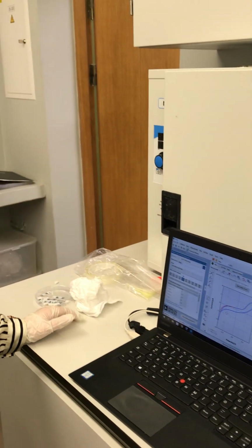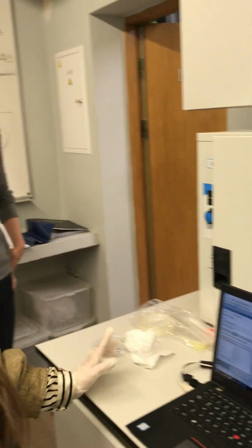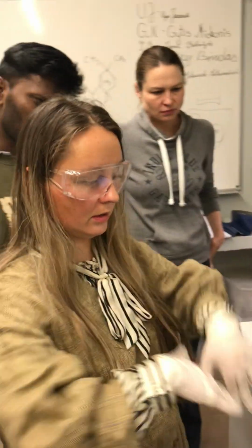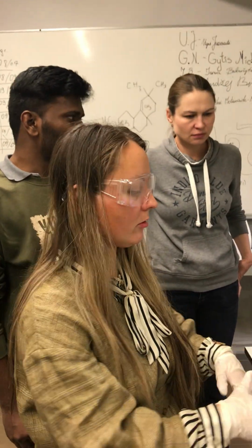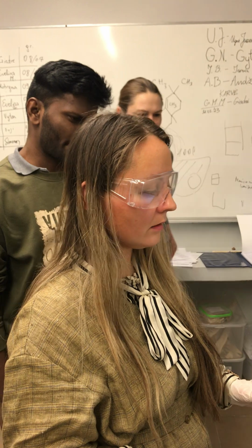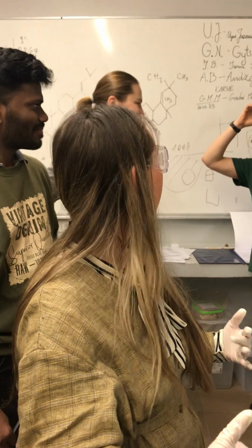Usually what we do, we get this preliminary data and then we do reports, and later more deeper analysis. We would run different scan rates, for example, or different concentrations of analyte to make sure we have what we have. And yeah, it's a good control, I would say. We will overlay later what we have.